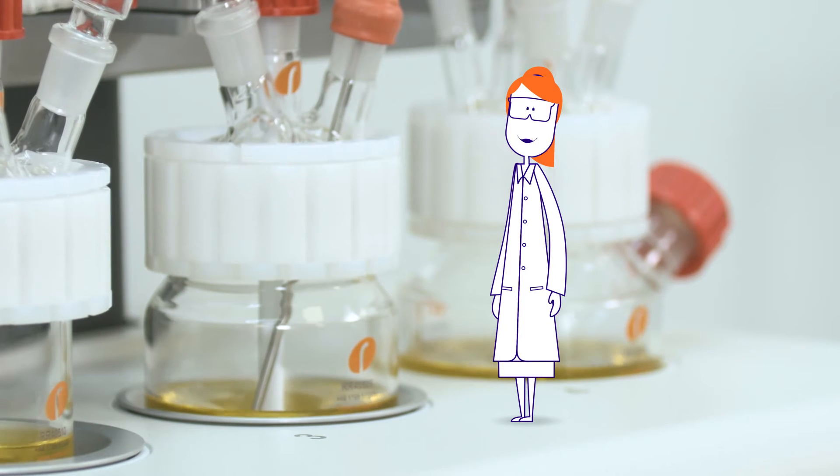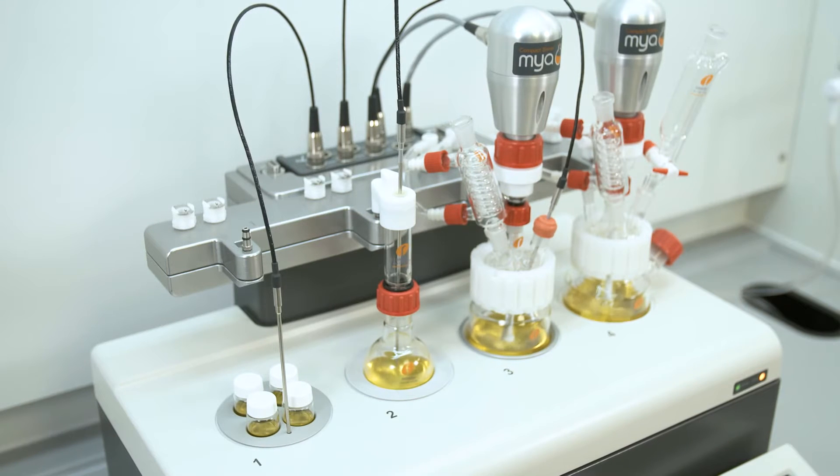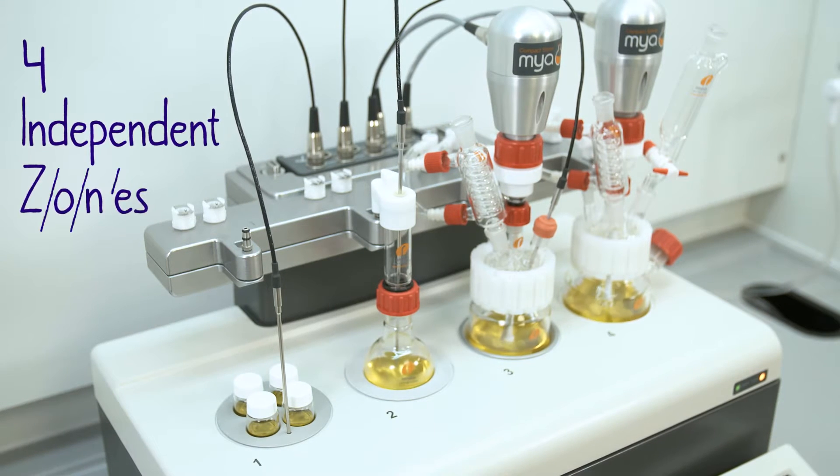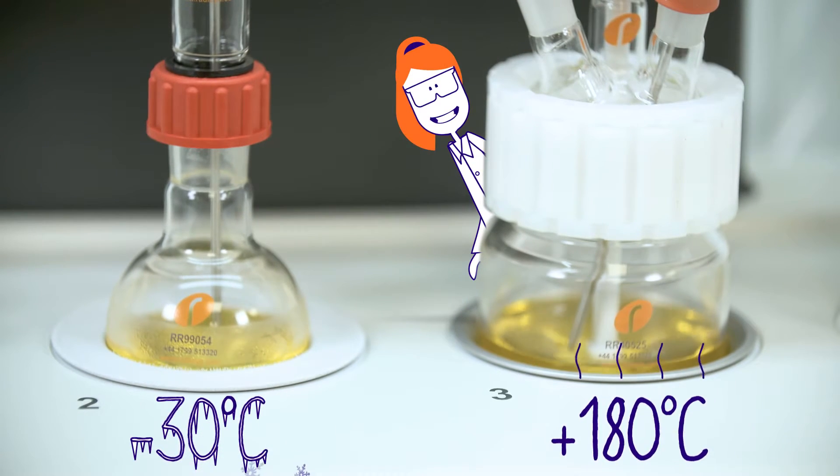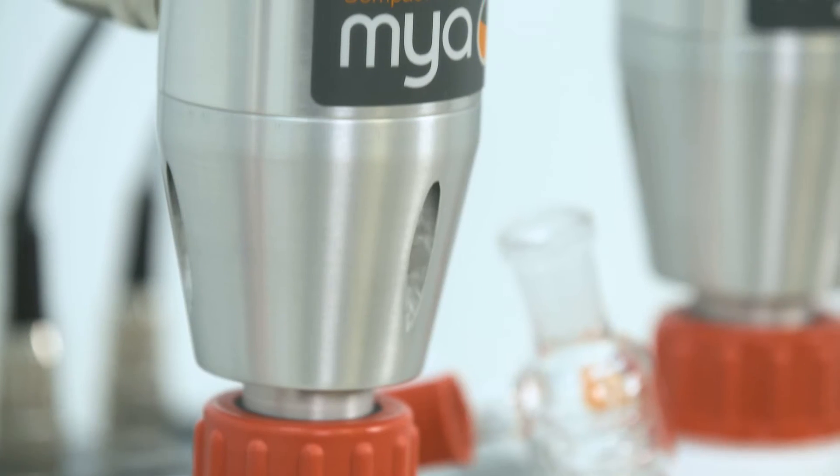Impressed? You should be. Maia 4 will heat and cool up to four positions independently from minus 30 to 180 degrees with a choice of magnetic or overhead stirring.